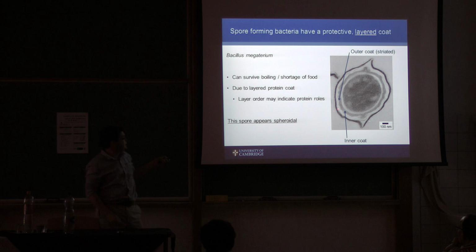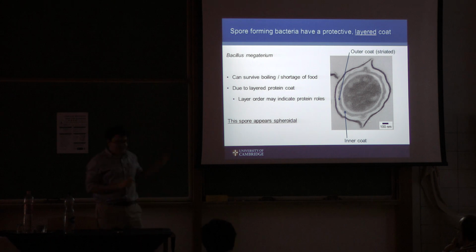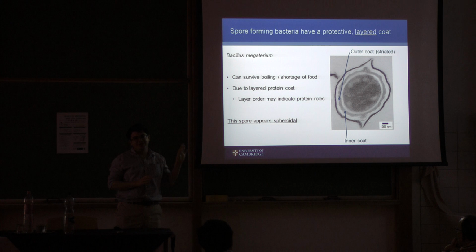So this is an electron micrograph of a bacteria spore. Bacteria spores are quite interesting, but they're very important. Effectively, this is a bacteria seed.